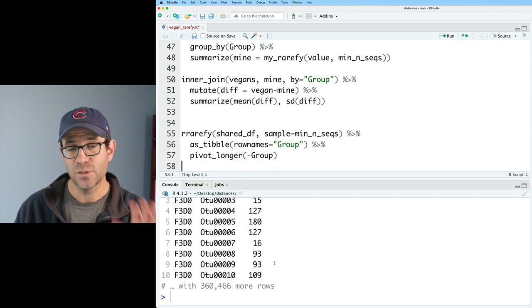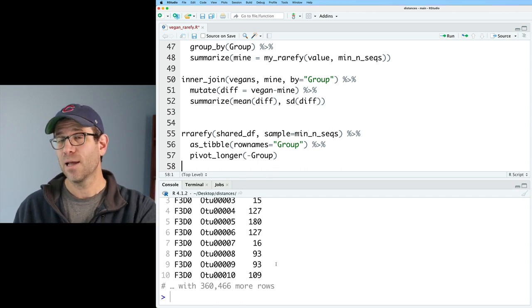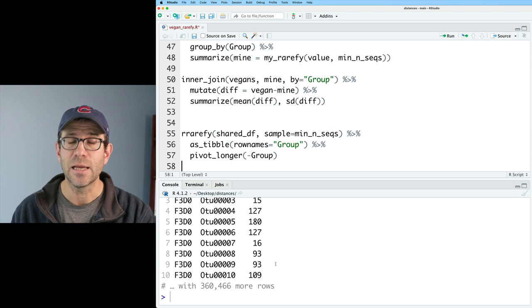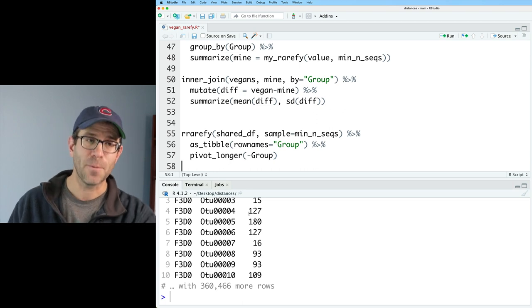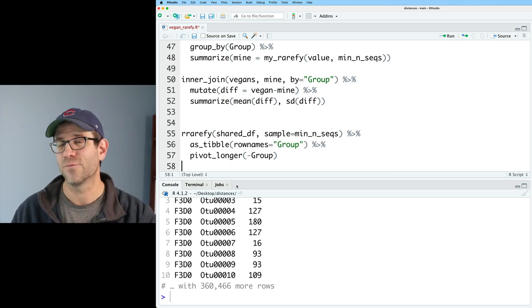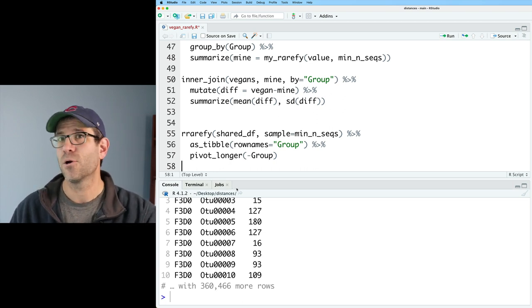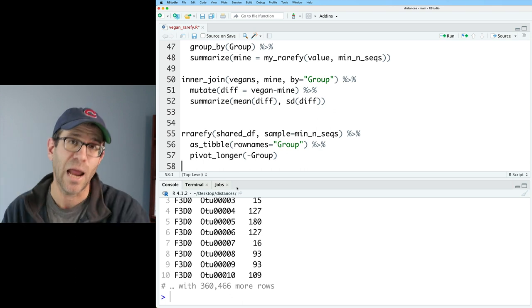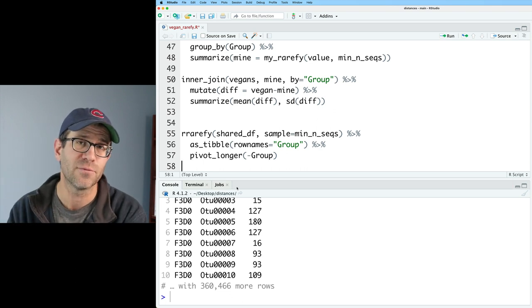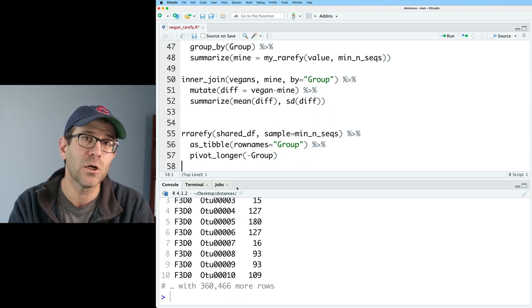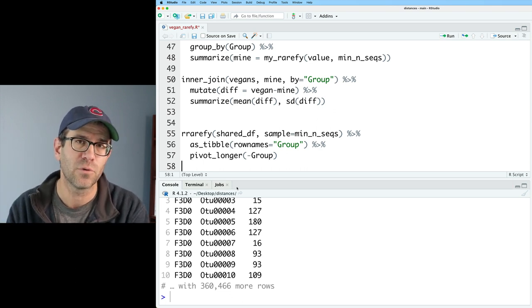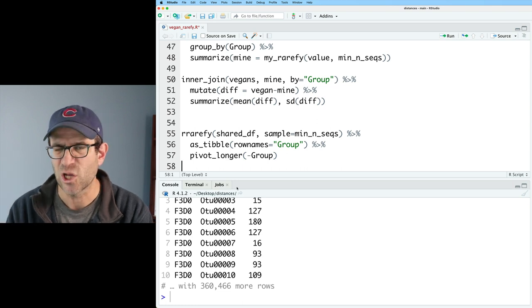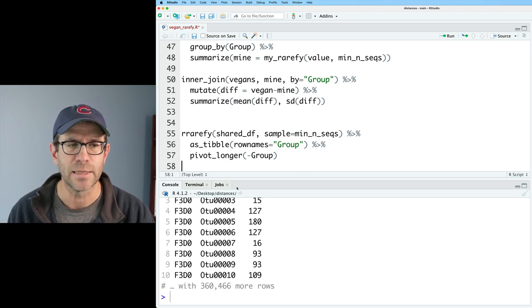Basically, this would be like one iteration of the rarefaction step. So we can do rrarefy and we can then give it again shared_df and I'll do sample equals min_nseqs. And so then this gives back just a mess. And we can then pipe this to as_tibble and we'll say rownames equals group. That gives us a tibble. And then we could make it long by doing pivot_longer and do minus group. And we're right back to where we started.